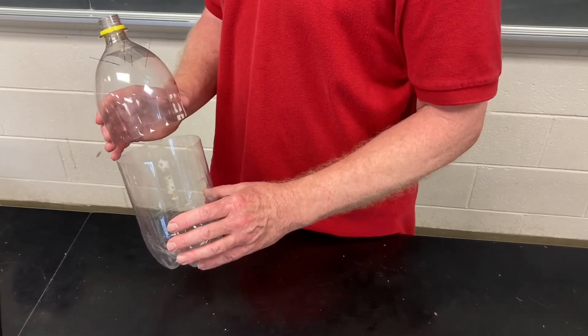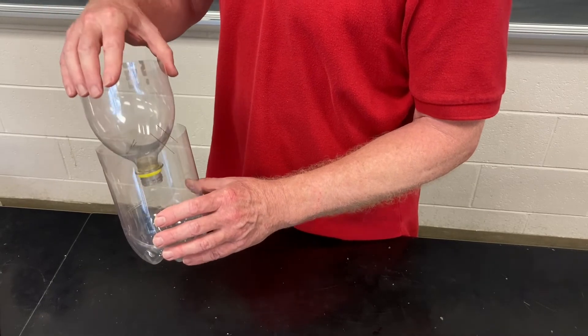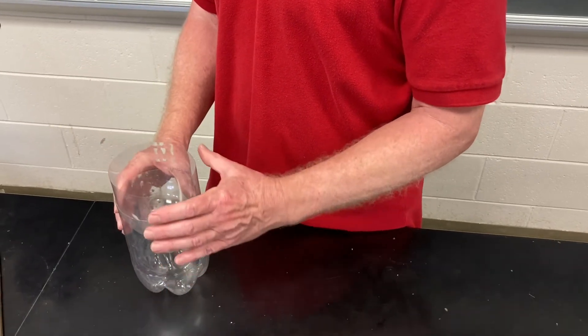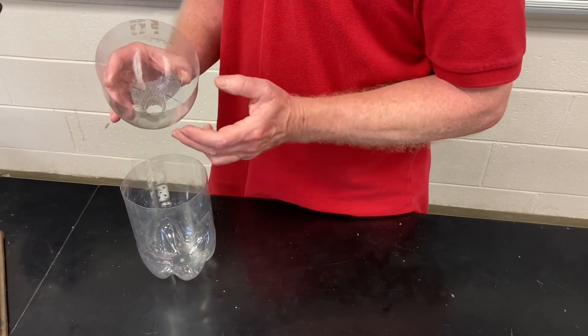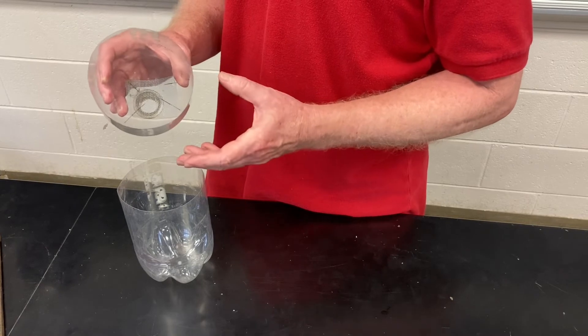So after you've cut your two-liter bottle, you'll see that the top part fits into the bottom part and makes a funnel. Now the next thing you want to do is to place a piece of screen on the inside — you can just lay it in there or you can secure it with some pins.